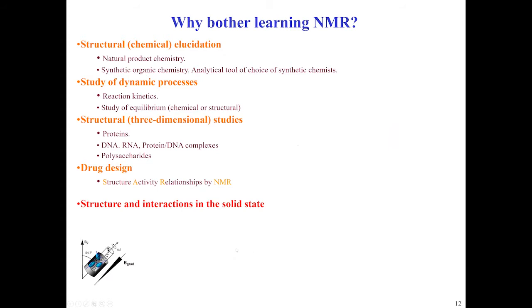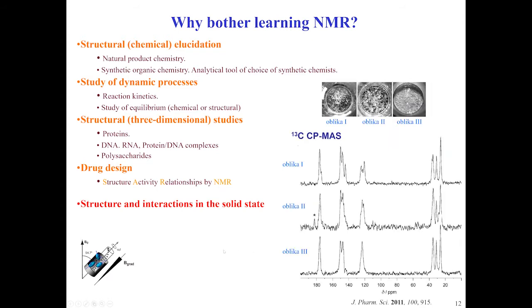Then, of course, I mentioned in between that solid state, and traditionally, this is quite, sorry for Slovene. So you would know that for pharmaceuticals, it's very important what the crystal form is. One is for IP issues, the other is for bioavailability. So of course, one is admiring these beautiful different crystals. I don't know how well you can see.